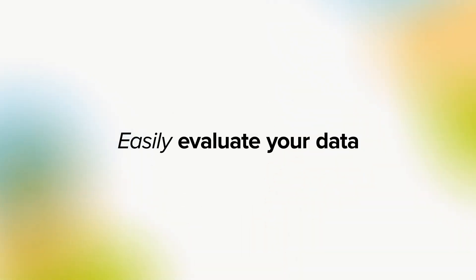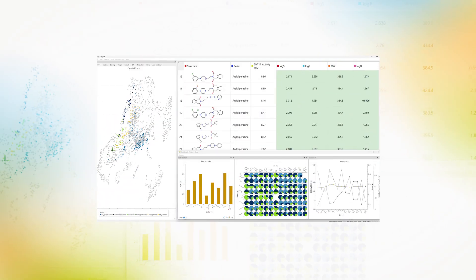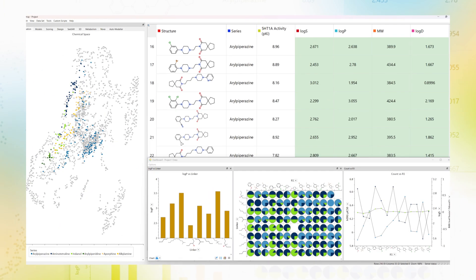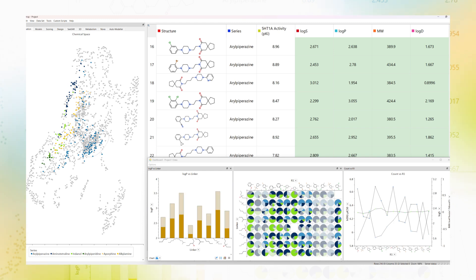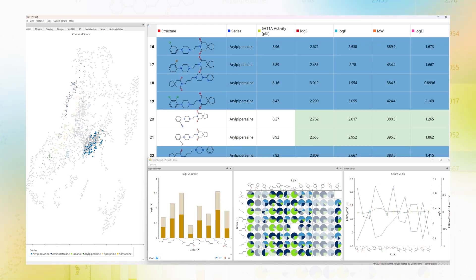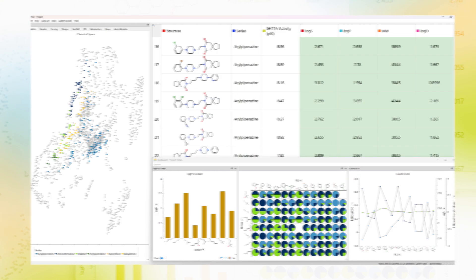Easily evaluate your data with smooth access to your databases, a wide range of interactive visualizations and innovative analysis features.